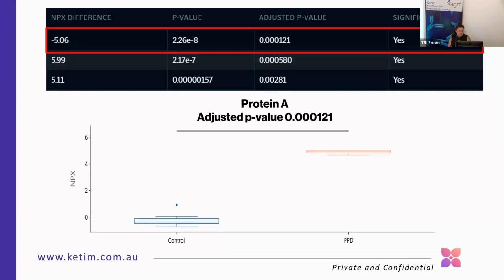And as you can see here, it automatically plots your results as well. We're looking at just 10 here, 3 PPD, 7 controls. Again, this was exciting to me because even though it was a very small number, we were still able to see such high significance between these proteins. So that was very exciting for me.